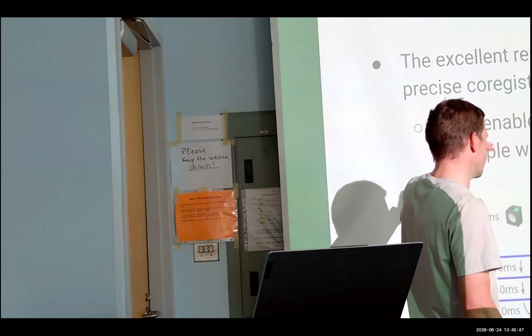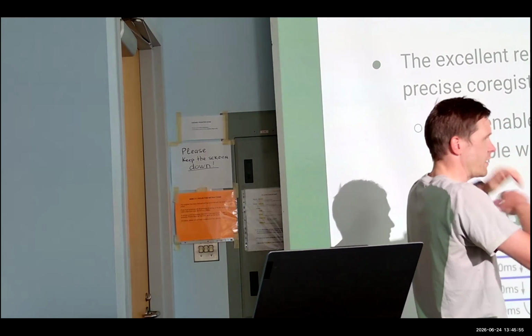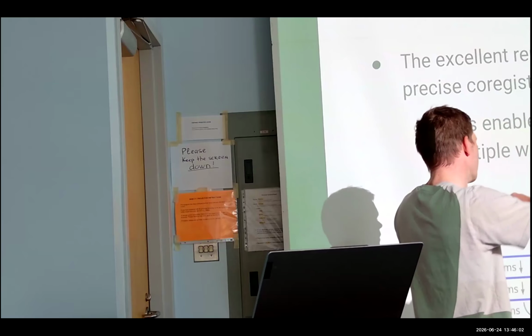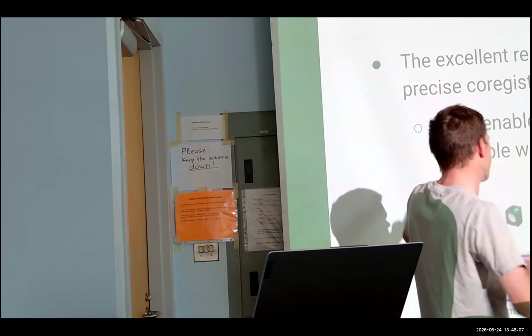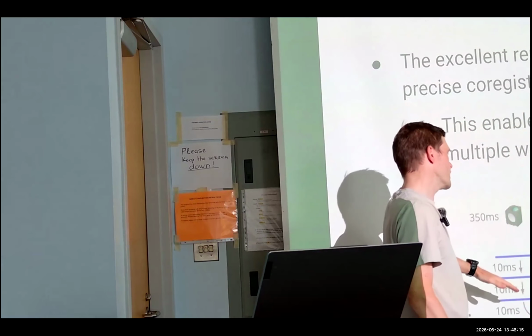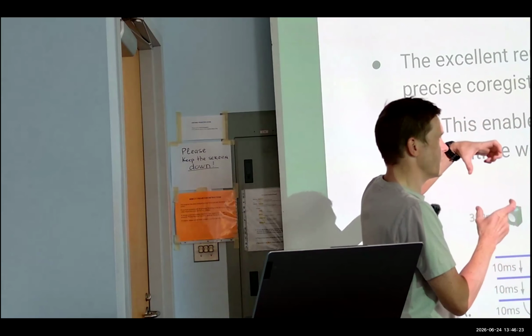So if I want to image the same point at 3 different heights in 3 different channels, so I'm taking 9 images, and I have a very repeatable stage, I know I can do one full stack on one color, move to the next one, do the next full stack, and then the next, and I know they will all line up.